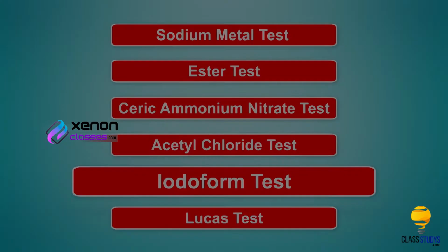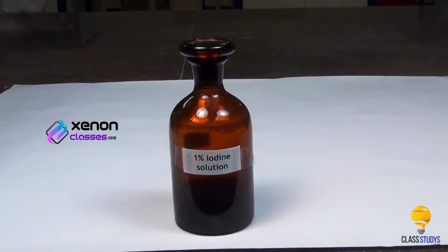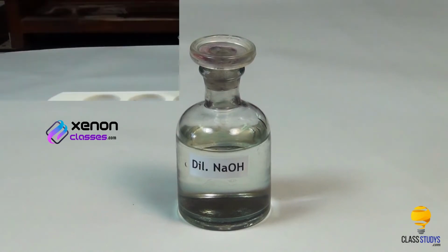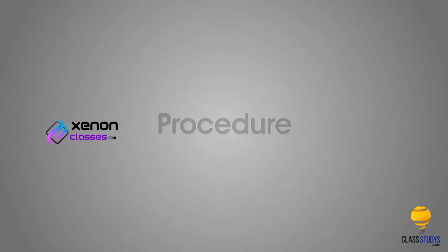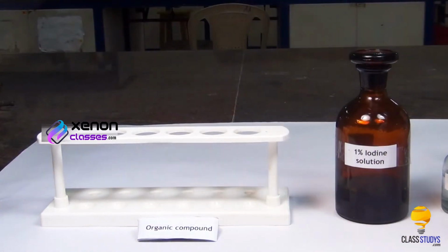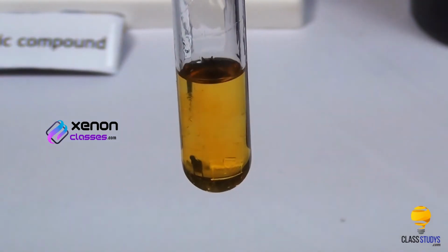Iodoform test. Materials required: organic compound, 1% iodine solution, dilute sodium hydroxide, test tube, droppers, and water bath. Procedure: take a small quantity of organic compound in a test tube. To this, add a small quantity of 1% iodine solution using a dropper.